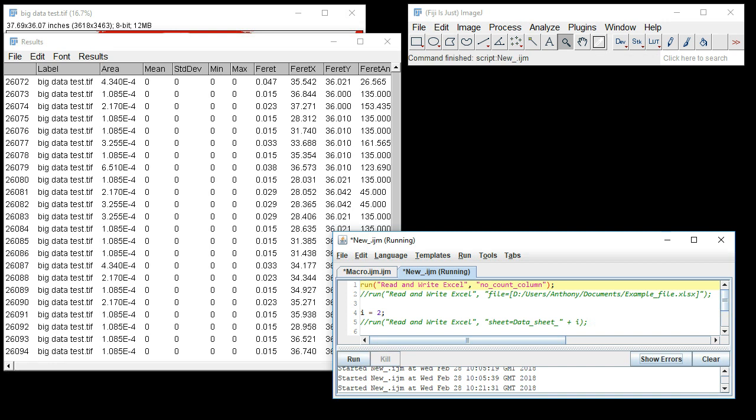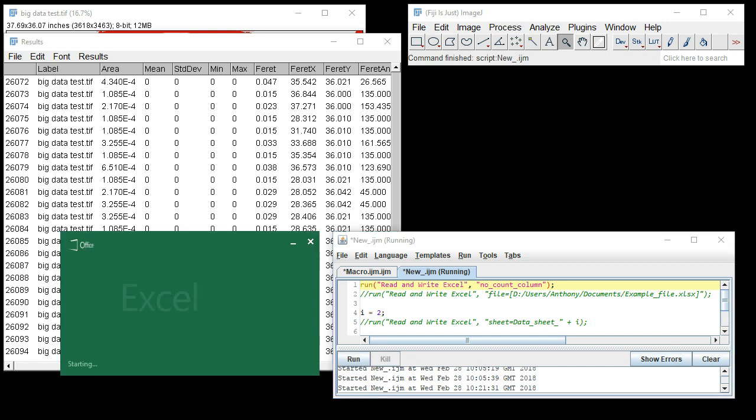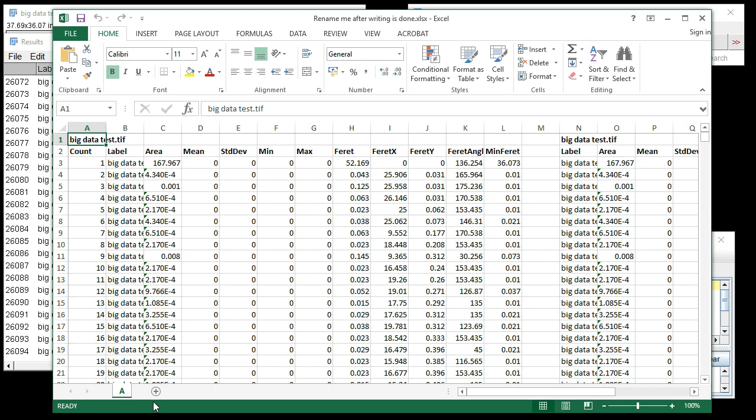In that existing file on our desktop, we can see that the contents of this results table has been added adjacent to the previous set, but this time with the counts omitted.